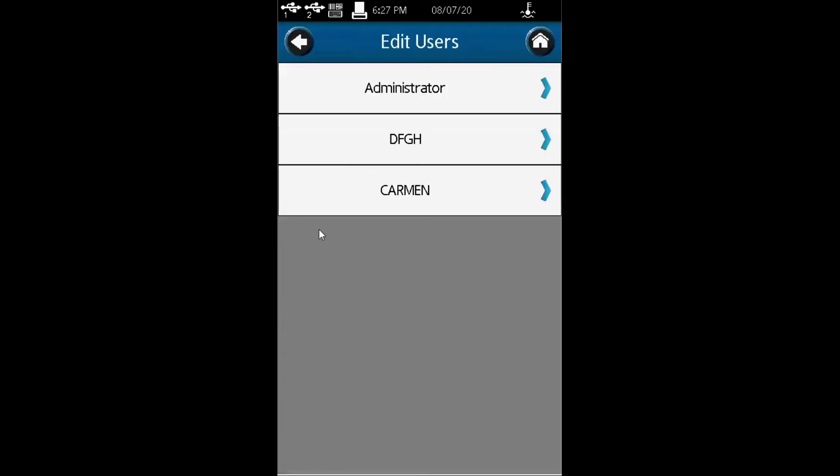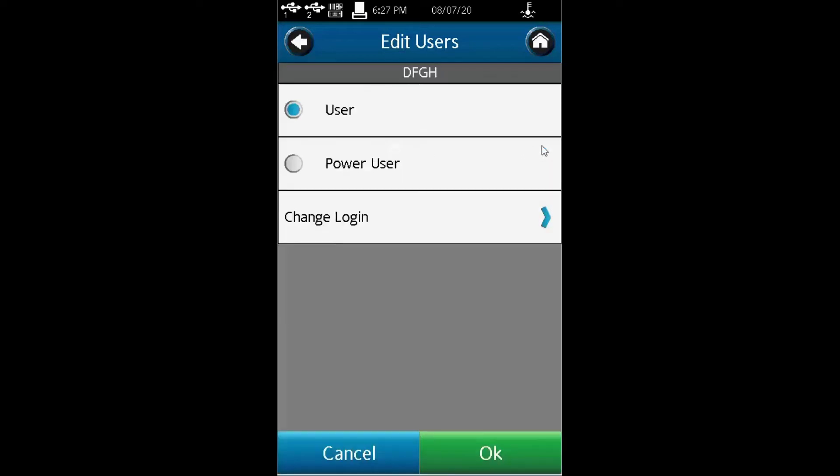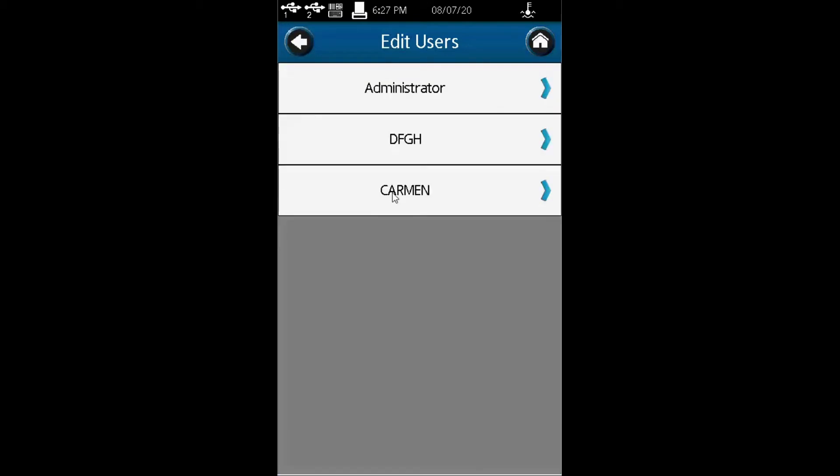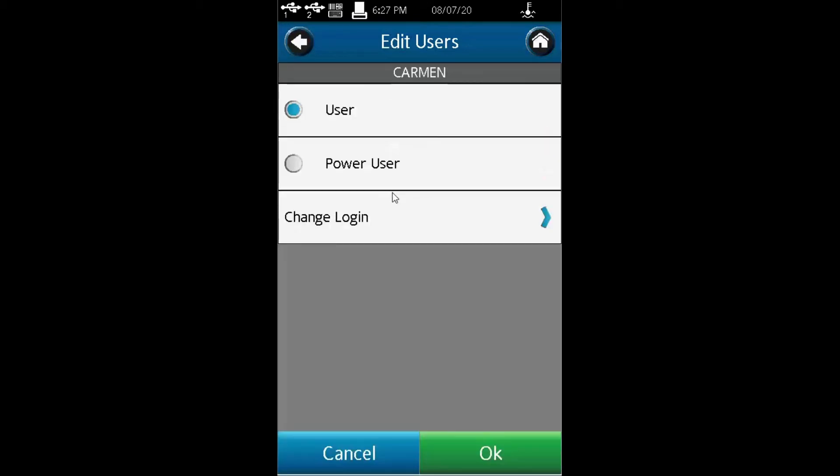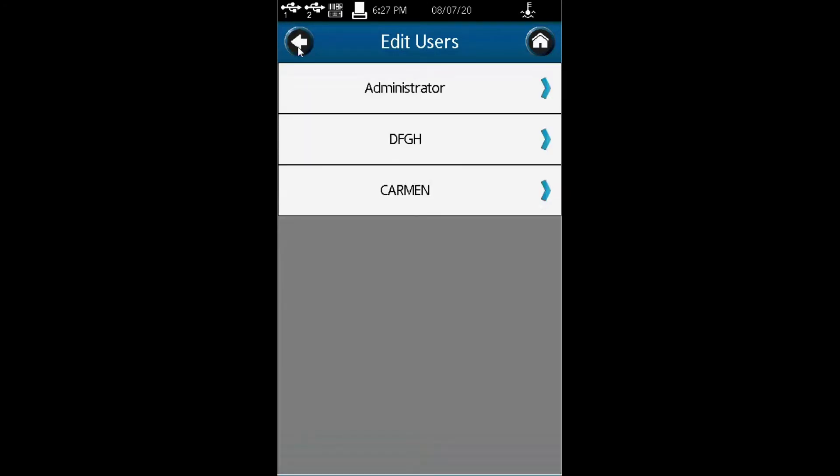You can edit users. For example, for a user like DFGH, you can edit whether they have user or power user access, which determines the level of permissions given to that person.